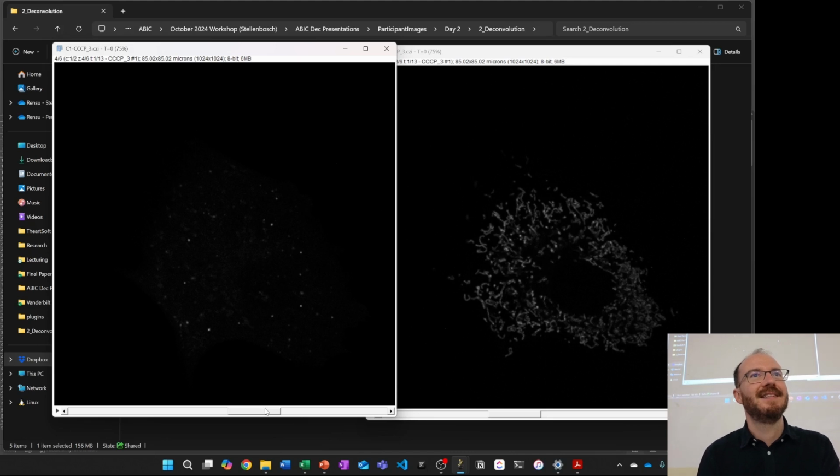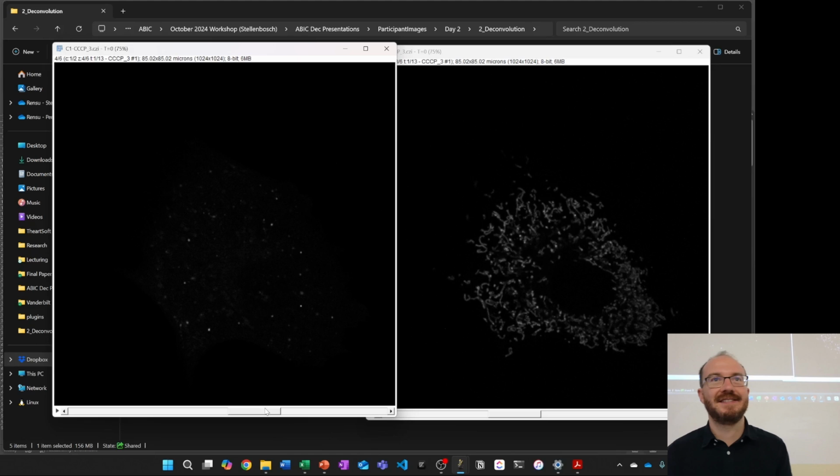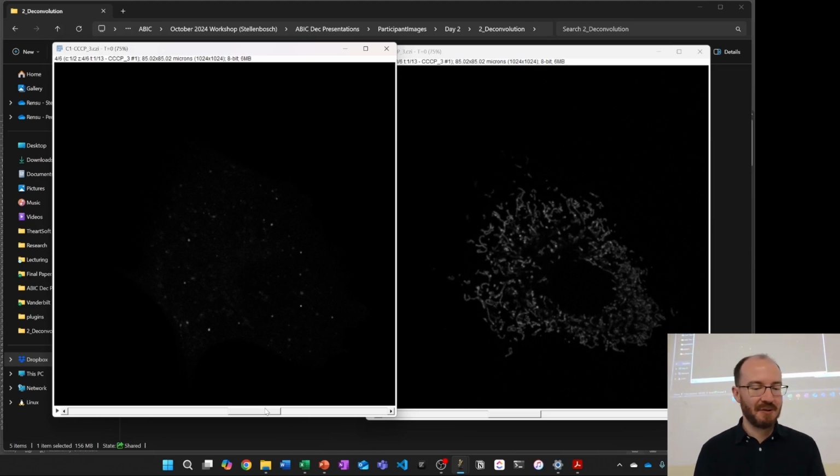In general, we use Z stacks, even if it's just like 3. Yes. But it would be interesting to know. It's probably going to work. I haven't tested it out, so I can't confirm, but probably it will work. It's just, yeah, you're obviously losing all of the Z resolution, but you've in any case thrown it out already, so you don't have any hope of getting it back after deconvolution.